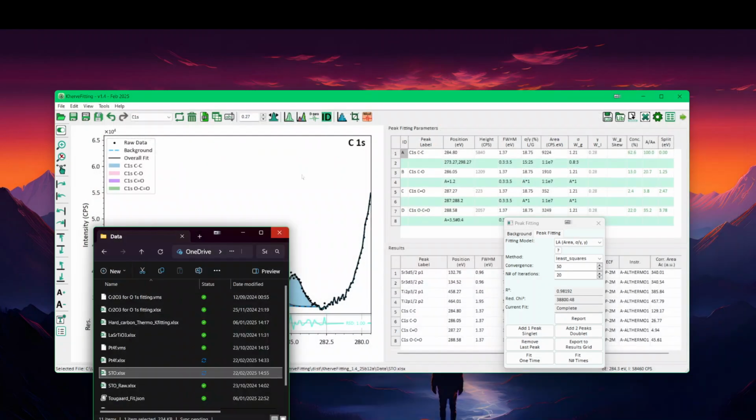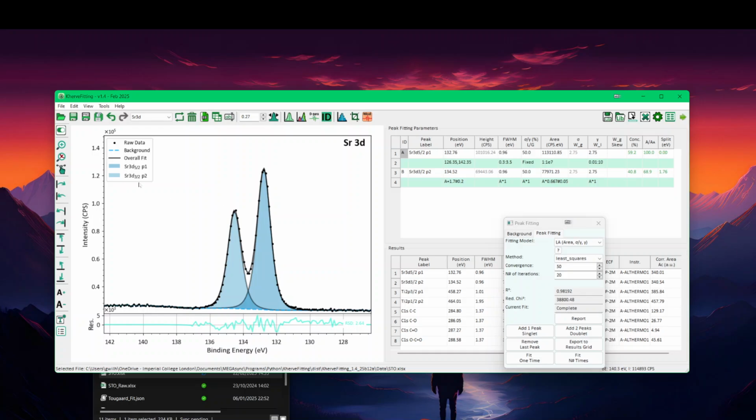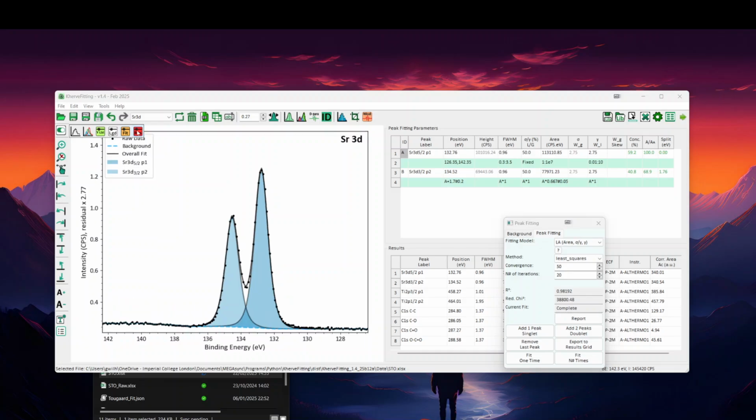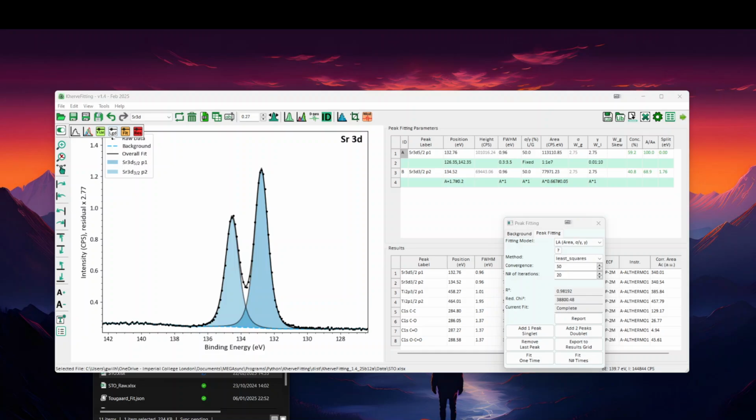You know, you can simply go into here, go to the toggles. Let's say you don't want any residual, you remove that. If you want the residual at the top, you can put that. Let's remove it. Let's say if you don't want any Y label, just remove it. If you want just the X title, the intensity title, put that in.